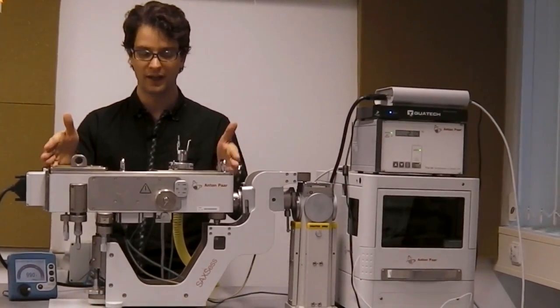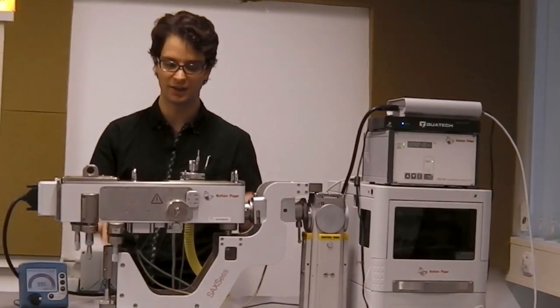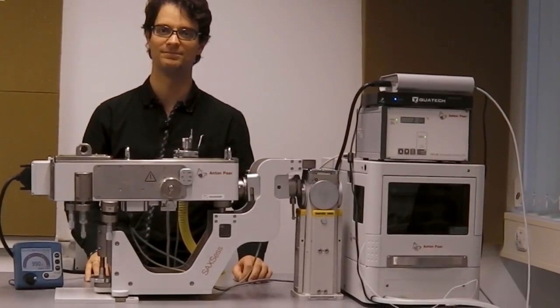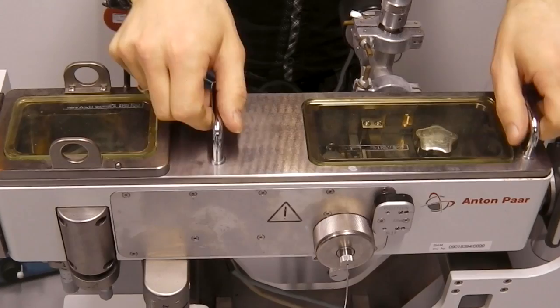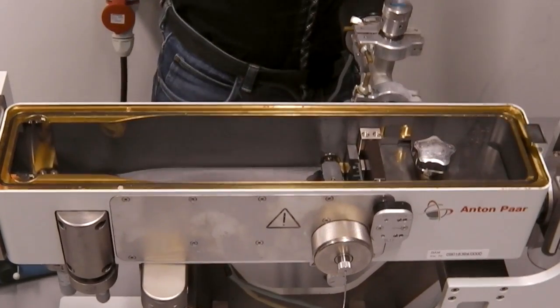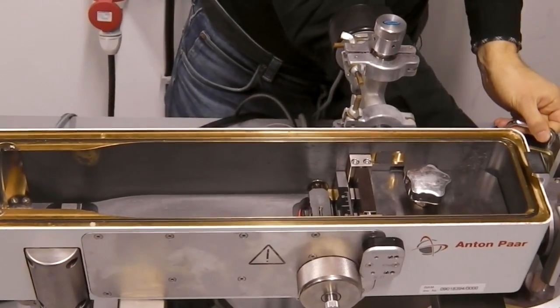When we take a closer look at the actual instrument, we can see the components inside. When we open it, we see a few components.